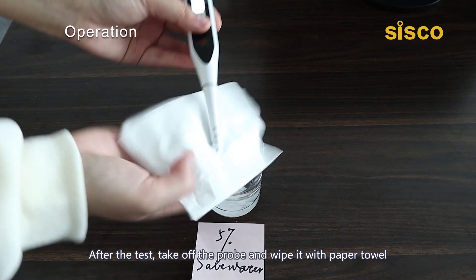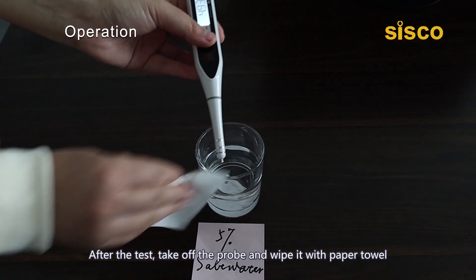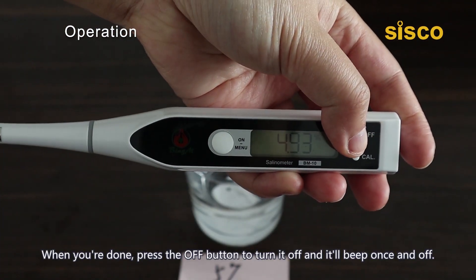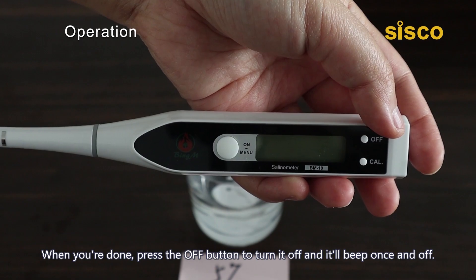After the test, take off the probe and wipe it with a paper towel in order to get a precise measurement in following tests. When you are done, press the off button to turn it off and it'll beep once and turn off.